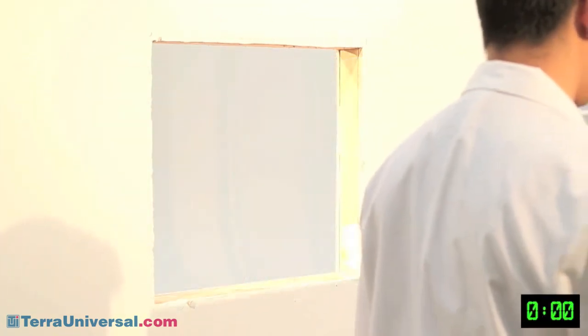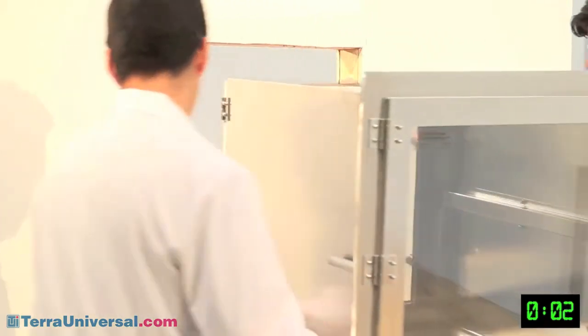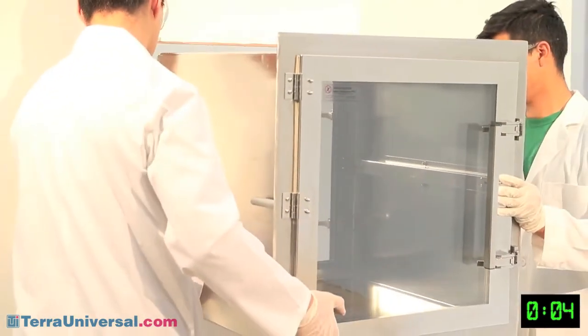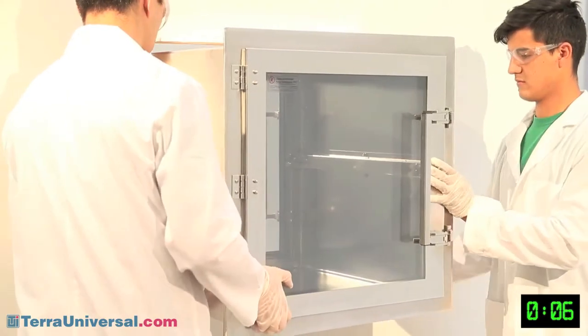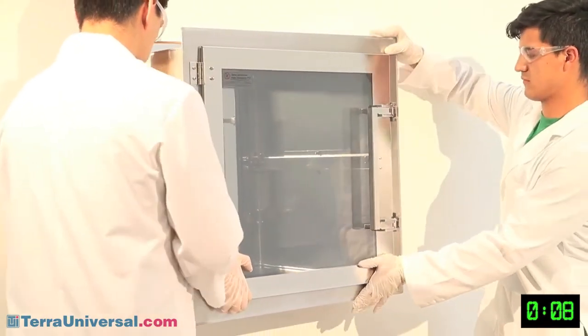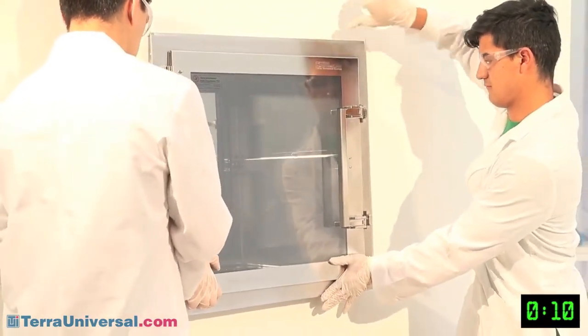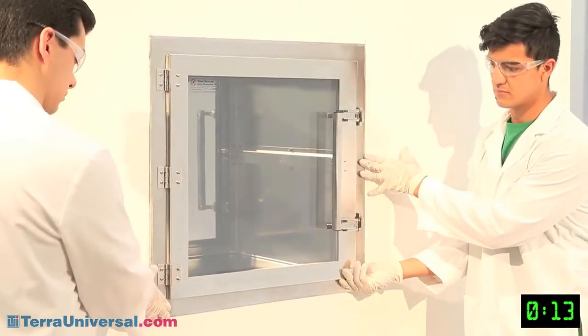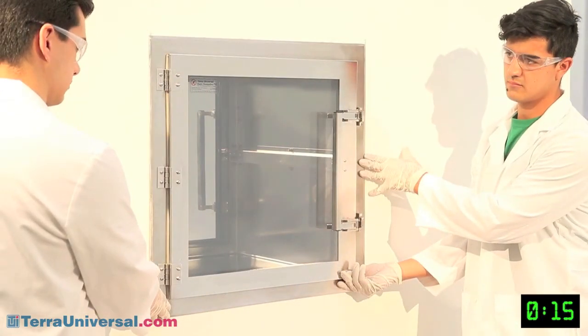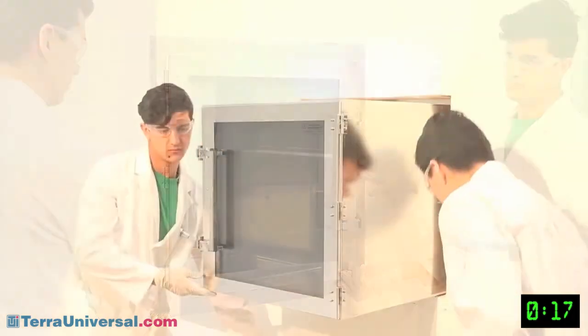Start by inserting the chamber through the wall from the clean room side. The clean side bracket forms a tight seal against the wall without fasteners, cleaning obstructions, or horizontal surfaces that can collect dust. As long as the wall is flat, no caulking or other finishing is required.